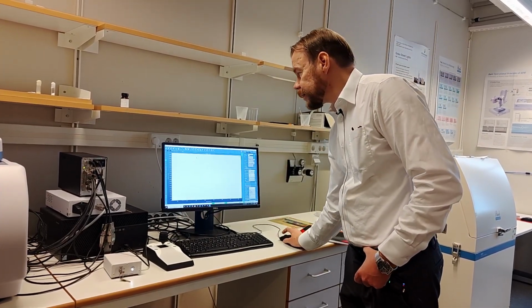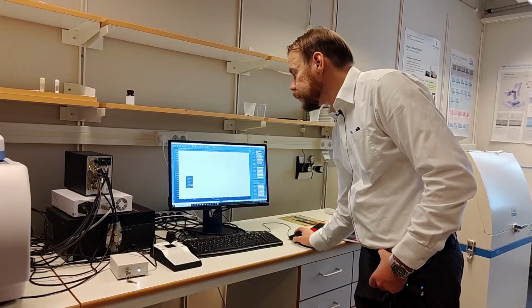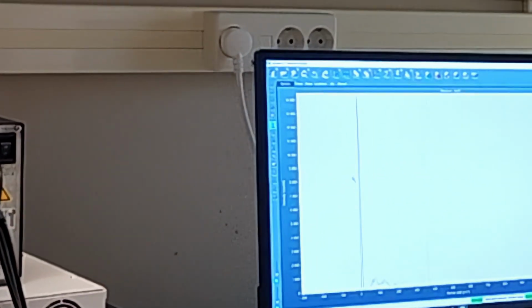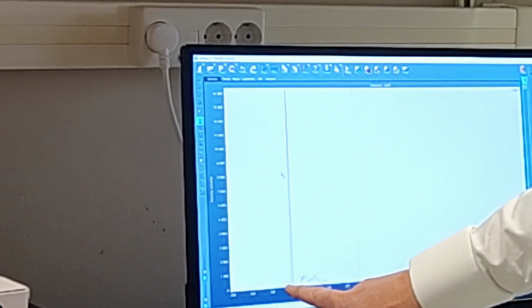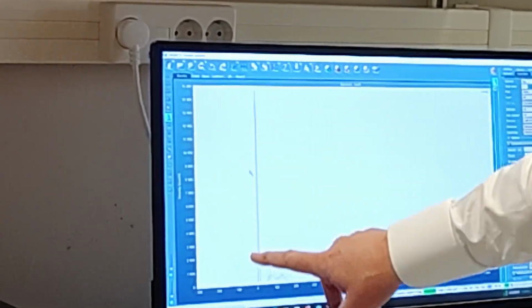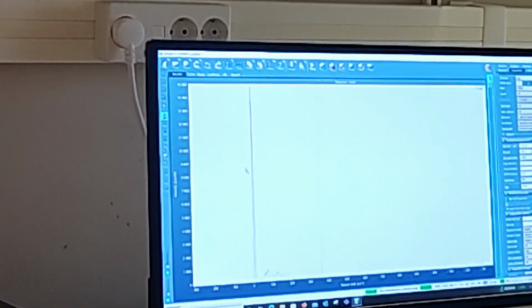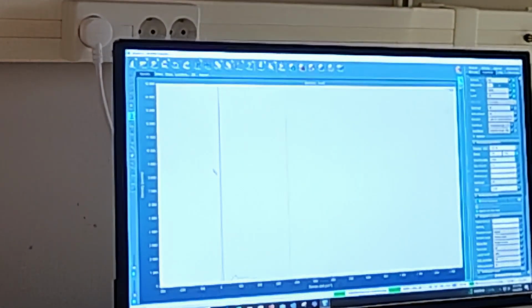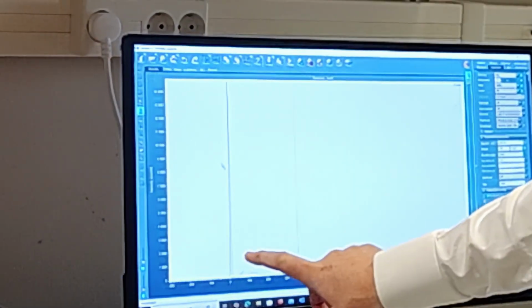Now we can see something there, right? So at 100% laser, at half a second, we get this one at 0. That is the reflected laser. That is not part of the Raman signal. This is the interesting area, right?